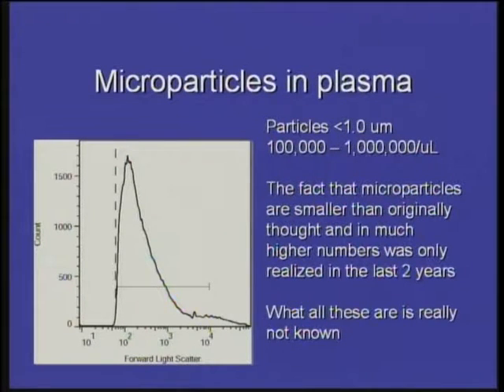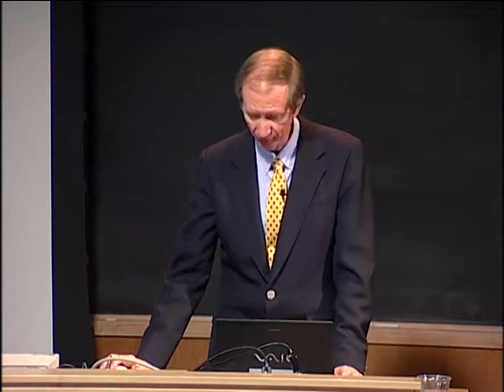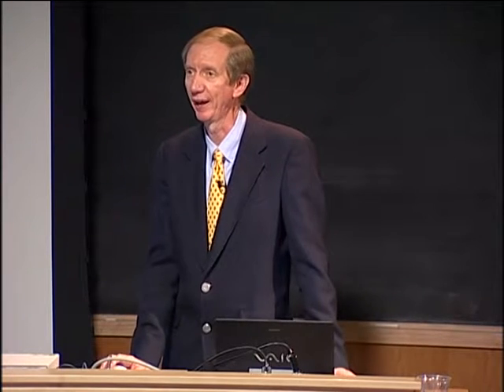So one day in the lab, we got this thing, we were playing with it, and I said, let's just put some plasma in it and see what happens. Not even labeling it or anything. We're just going to take a plasma sample. We'd run these things on the LSR2, and we were getting the typical kind of thing, 1,000 per microliter microparticles. We put it in here, and all of a sudden, what did we get? The first one we ran had 1 million per microliter microparticles, so 1,000 times more.